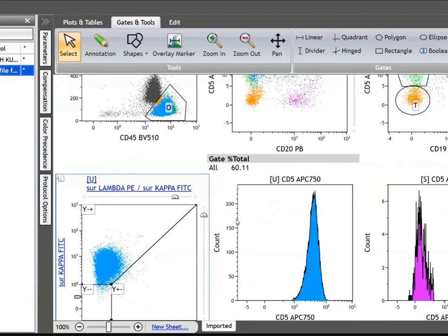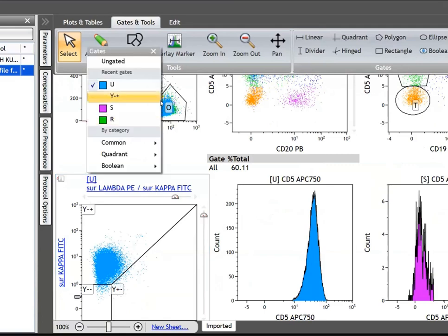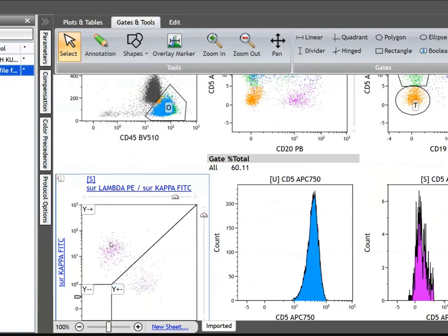See, restriction means this: normal B cells, when they are getting formed, some may be kappa, some may be lambda. So if you see normal B cells, some cells show kappa light chain and some show lambda light chain. But when a neoplastic clone arises, it's a clonal population, right? One cell becomes 2, 2 becomes 4, 4 becomes 8.